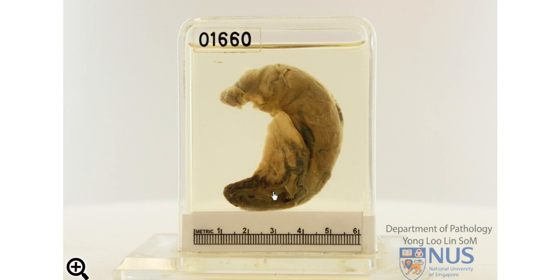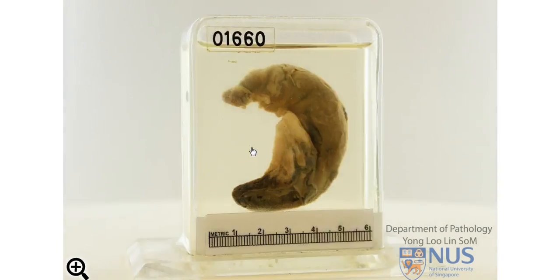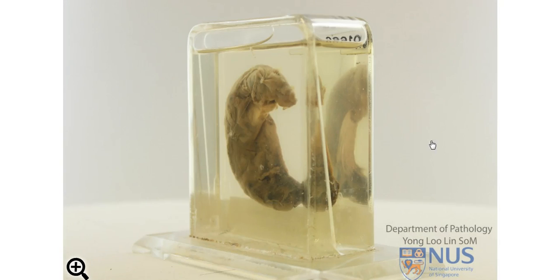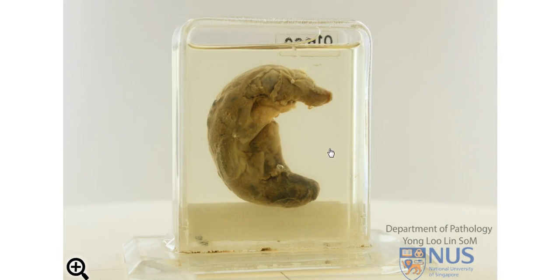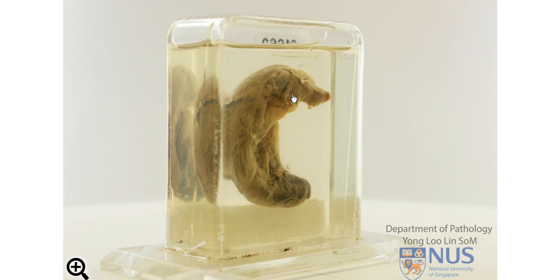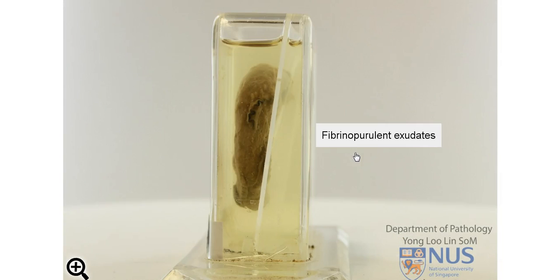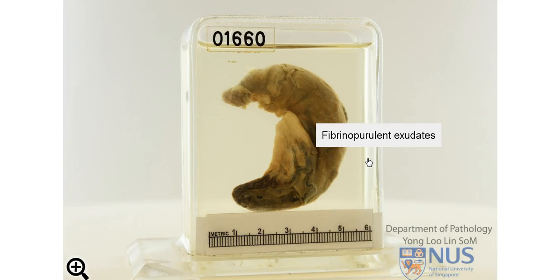We're looking inside the lumen here and this is the cross-section of the appendicil wall. Looking at the serosa, we can see that there are some yellowish exudates on the surface that make the serosa appear opaque rather than translucent. We can appreciate the exudates a little bit better looking at this other surface, and under the microscope we would be seeing fibrinopurulent exudates — fibrin and numerous neutrophils — and this would be an acute inflammatory infiltrate or exudate.